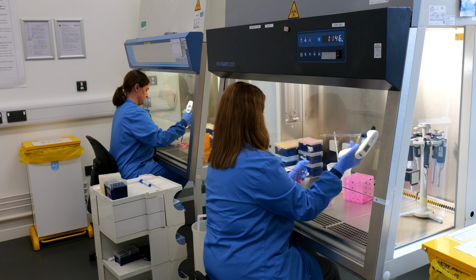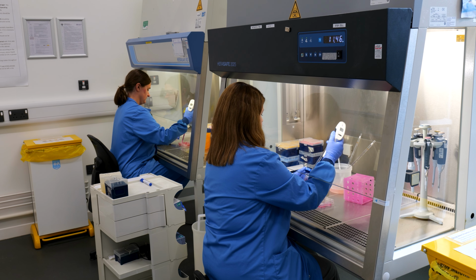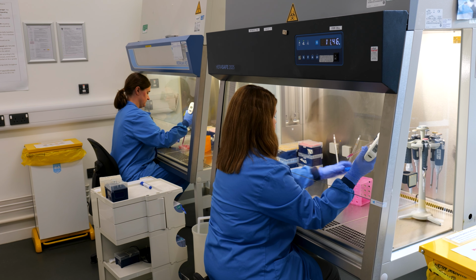3D models are much more representative of what's happening in vivo than 2D models, and I liken it to, you can play a game of football lying down on the ground side by side and not being able to move, but it's not very representative of a real game of football. And it's the same with cells. When you grow them in 2D cultures, they only interact side by side, whereas when you culture them in 3 dimensions, they're able to interact on all 3 dimensions with each other, but also you can incorporate other cell types into that model and model these interactions with other cells, extracellular matrix that they would have in that natural tumour microenvironment, and build something that is a little bit more, or a lot more, representative of what happens in vivo.